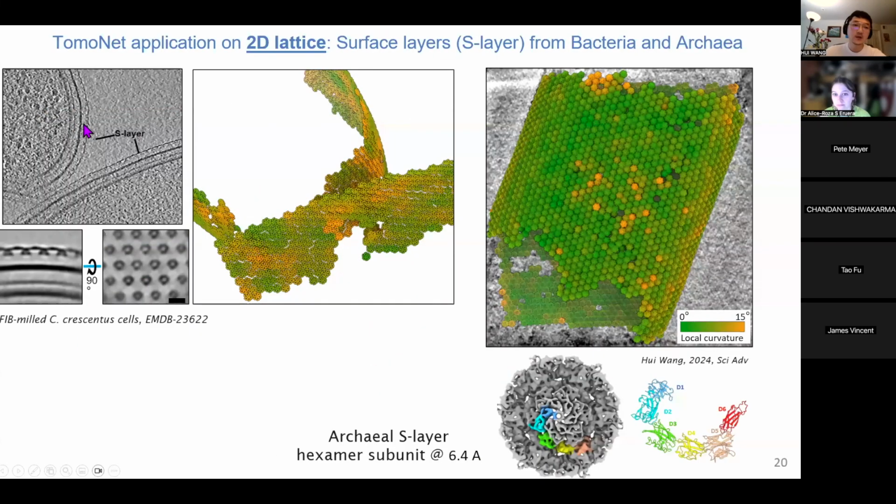If you look over at this tomogram, you don't see a feature like that. You see a very blurry and very thin layer. But by using the auto expansion function, you actually have a very strong geometry restraint on this particle, which avoids too much search over some very strong density.